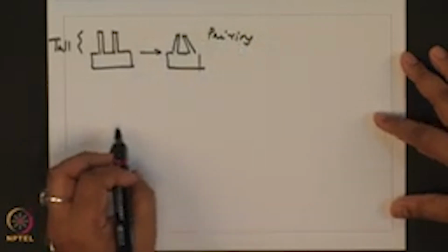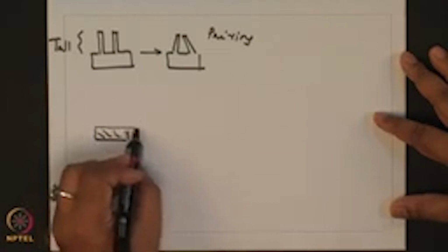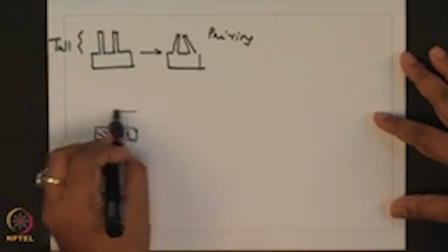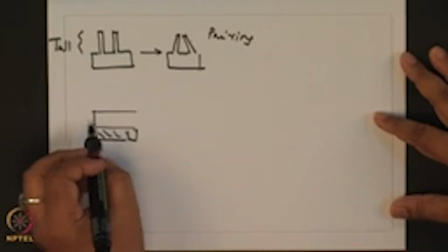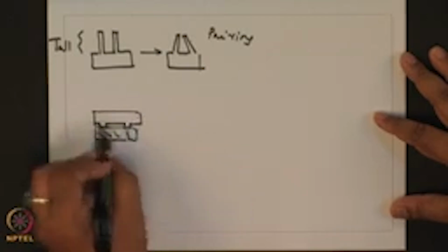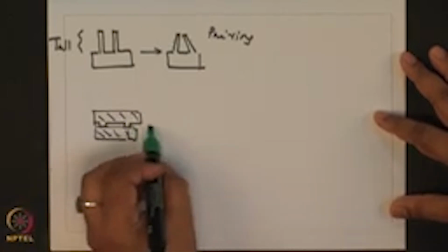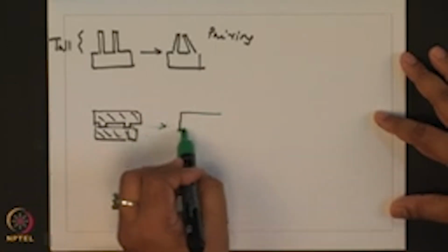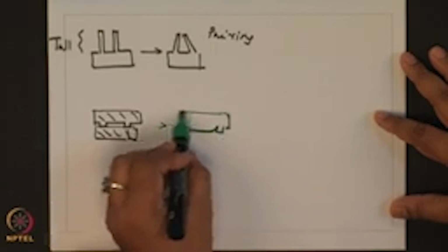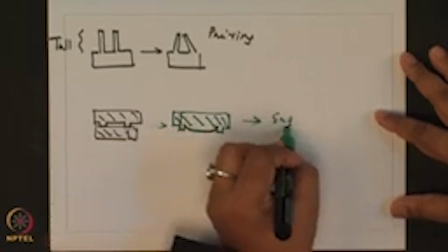In addition, on top of a substrate, after you have made the PDMS, you want to invert your PDMS onto a new substrate, after coating it with a given ligand. But in this case the PDMS might sag, so you might have this kind of a geometry. This is a sagging issue.